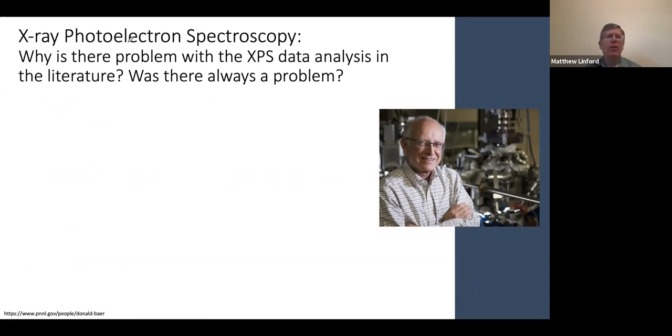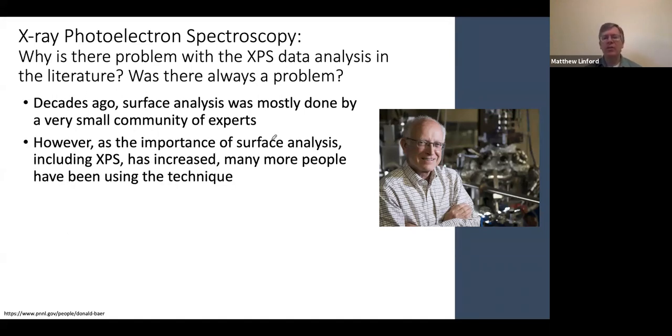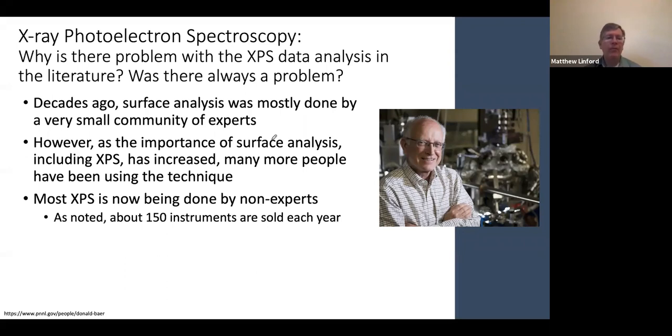So, our question was, let's back up a bit. Once again, why is there a problem with the XPS data analysis in the literature? And was there always a problem? And once again, decades ago, the surface analysis was mostly done by this small community of experts. But now it seems like everybody's using XPS, but people just aren't really using it right. And in fact, most XPS is now being done by non-experts.